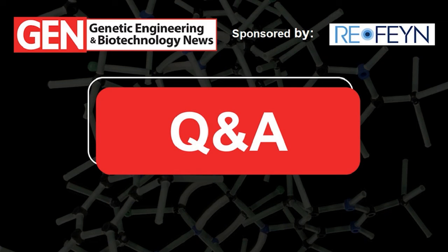All right, and I know this one's probably important for a fair number of our audience. ASPA would like to know if the equipment and software is compliant with 21 CFR Part 11. It is not at this time point. So we are not GMP compliant at this point. We are looking into this, but this will not be something that comes to the market in 2022. But we are looking into an upgrade version once it's available.